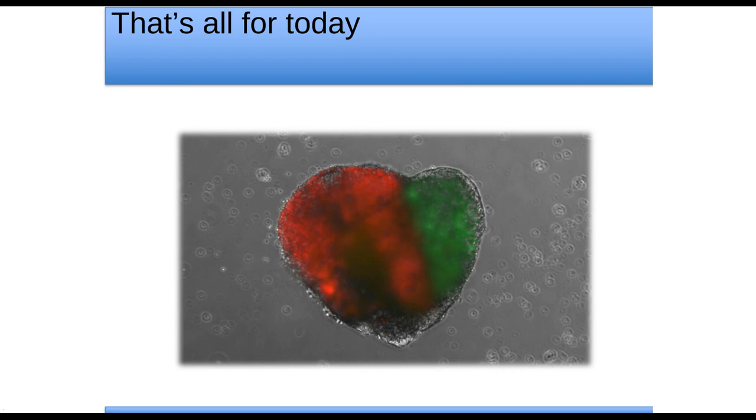Yeah, no, thanks for that question. That's a great question. So I think, first of all, for working with this protocol and working with pluripotent cells in general, it's all about reproducibility. There's a lot of variability in this system, so you want to make sure you have standardized and reliable differentiation protocols, and that also goes for this system. That goes down to making sure you plate the exact correct number of cells, et cetera. So that's for that part.